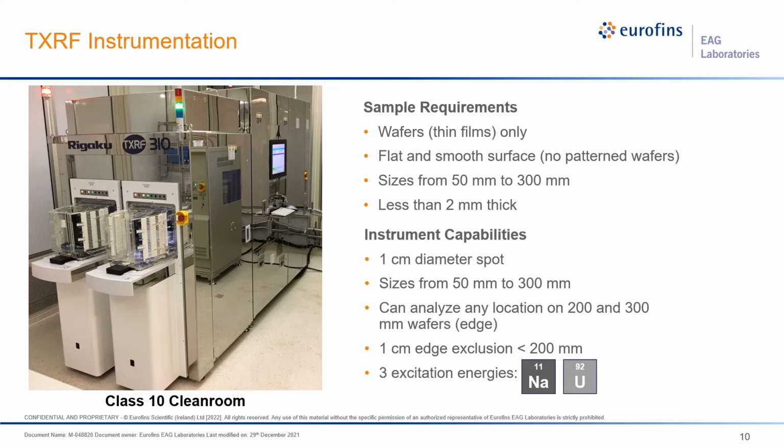This sits in a class 10 clean room so that we don't risk outside contamination of your samples. And just showing here on the front of the instrument, we have 2 different load ports. We have a load port dedicated to 300 millimeter wafers and one dedicated to 200 millimeter and smaller wafers.